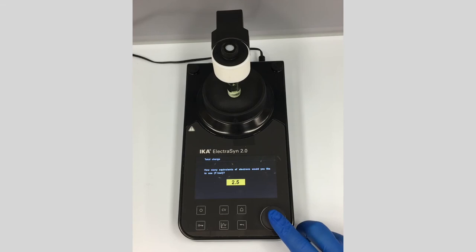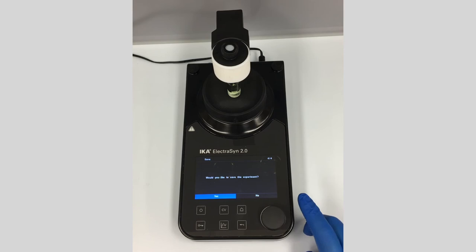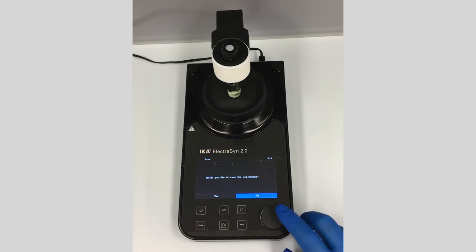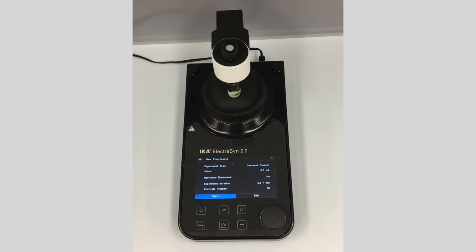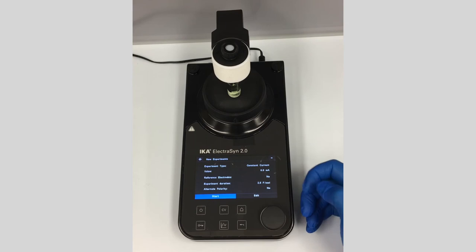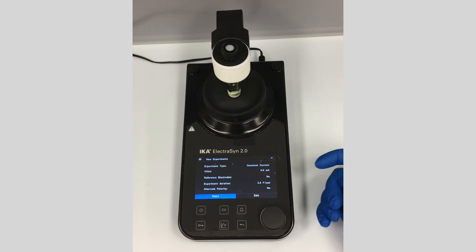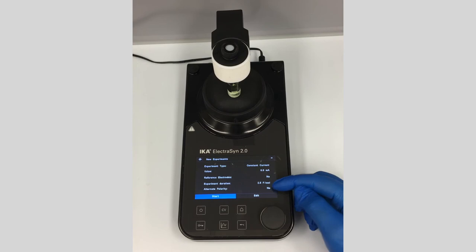You can save the experiment if you'd like, but it's easy enough to adjust parameters on your own — we won't save it here. This brings us to the pre-reaction running screen, which is the same for all reactions on the ElectroSyn. It shows all our parameters: experiment type is constant current, value is 8 milliamps, no reference electrode, duration based on the Faradays per mole correlated to the millimoles entered, and polarity alternation is off.